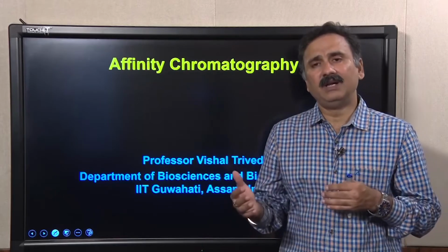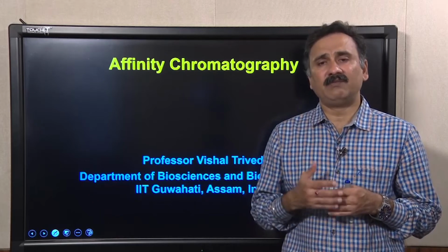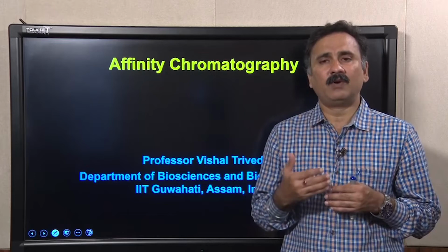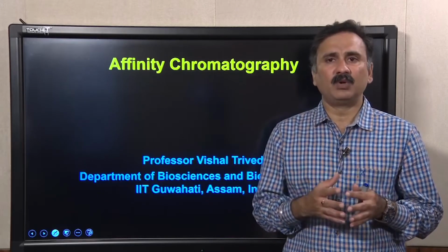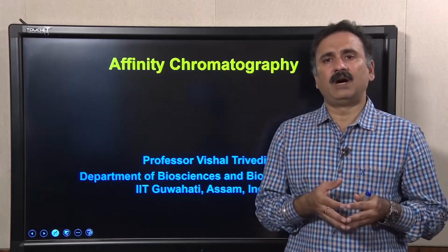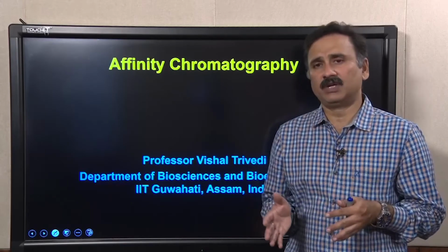Briefly, we also discussed how to perform affinity chromatography, what the different steps are to get the purified protein, and what advantages you have compared to conventional chromatography.